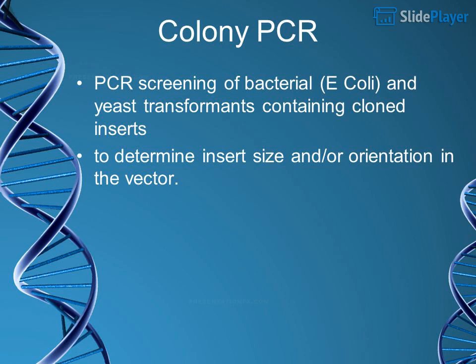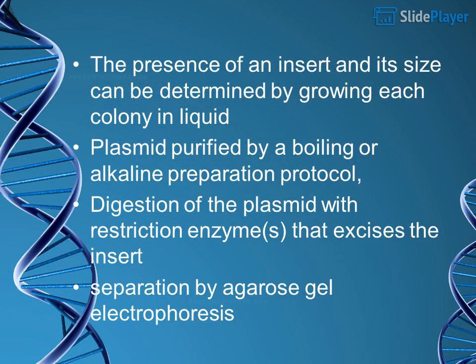Colony PCR, PCR screening of bacterial, E. coli, and yeast transformants containing cloned inserts. To determine insert size and/or orientation in the vector, the presence of an insert and its size can be determined by growing each colony in liquid.